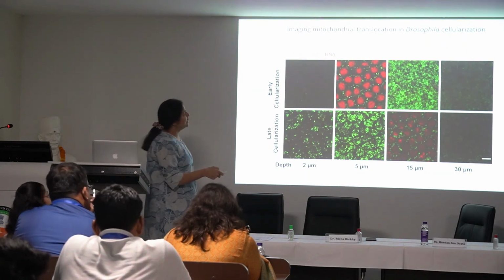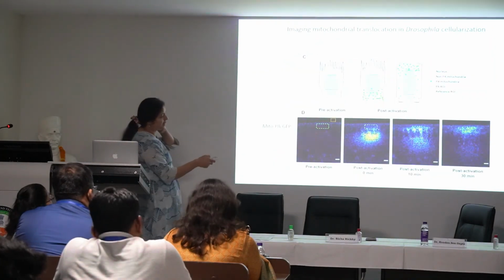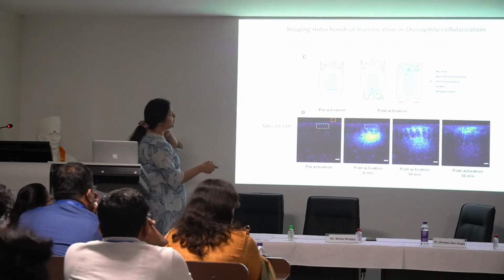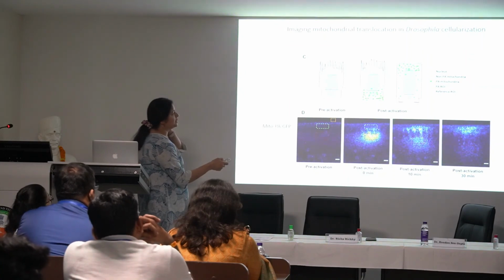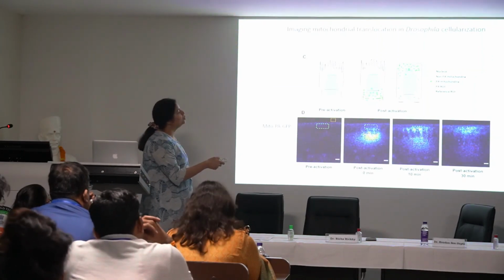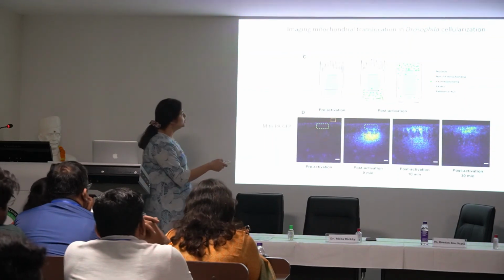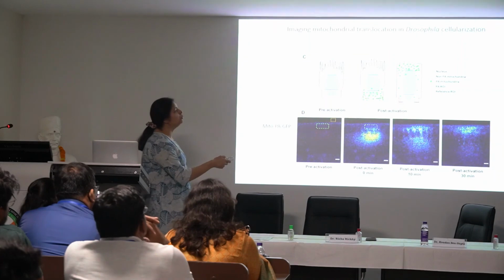The other is, why are they doing this? So now these are really tall cells which form at the end. They are almost 40 microns tall. And one of the reasons one could argue that this translocation of mitochondria is important is so that mitochondria are present in every location to provide local energy or function. And what we found was that when we use, for example, mutants of DRP, a dynamin protein responsible for fission of mitochondria, we have these long, big mitochondria which are now clustered at the bottom. Okay, they don't move to the top.